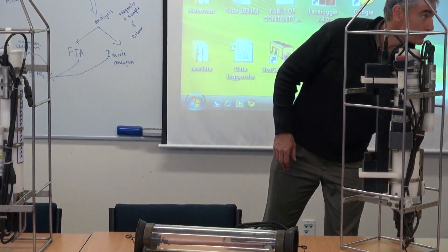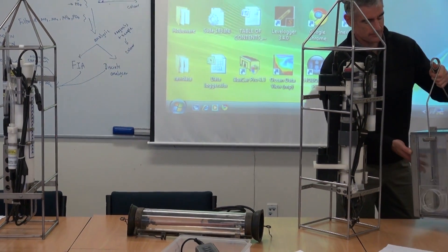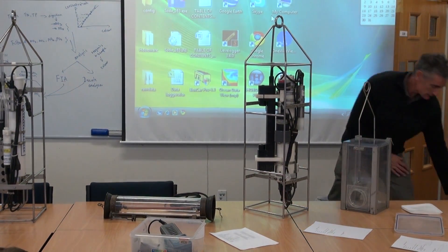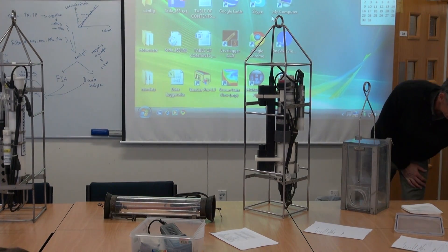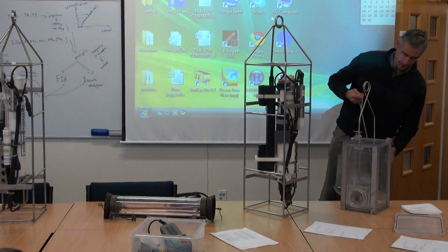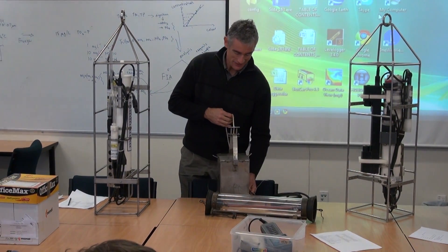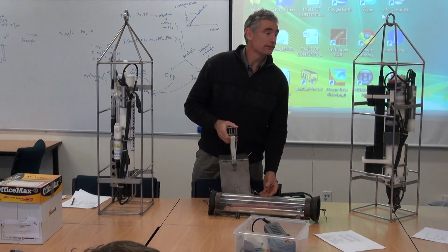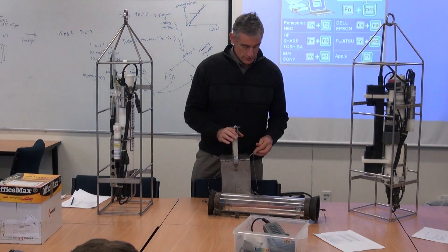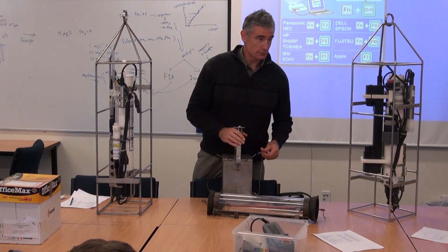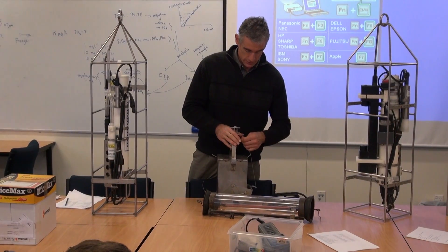A couple of our traps are pretty leaky too, so you get to know the good ones. Well, let me know which ones are the leaky ones, because I've had a main one. Does it really go for duffling sludge? That? No, I wouldn't recommend it. It's a water sampler, so this is what you want to use to sample.